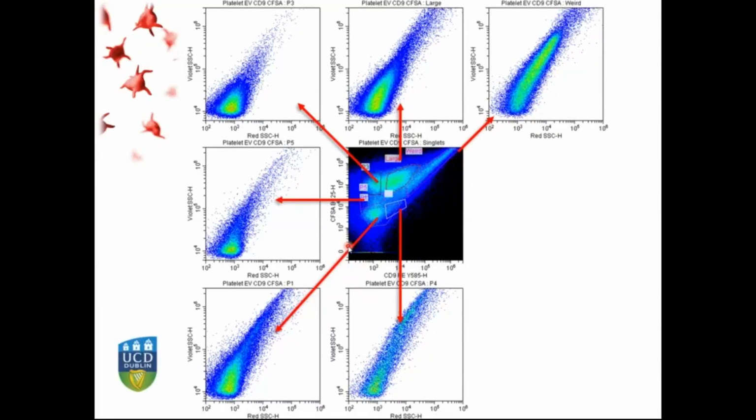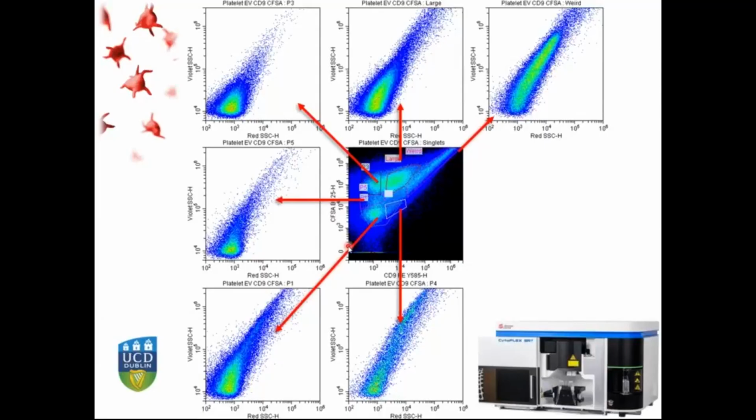Yes, we can. And again, Irene, an Erasmus student with very low experience in cell sorting, set up the instrument, prepared these EV samples, and I asked her to sort those 2 populations, for instance. We have sorted all of them, but I will show you just 2 of them.